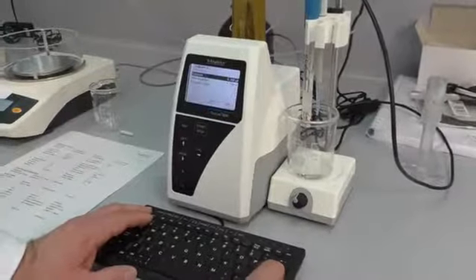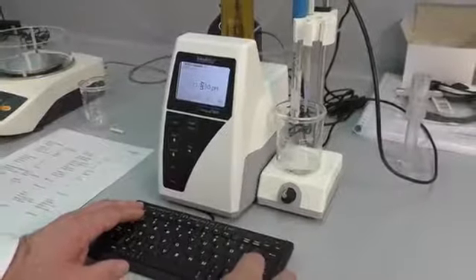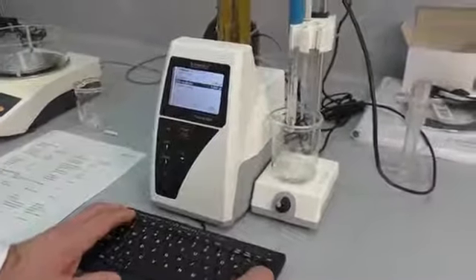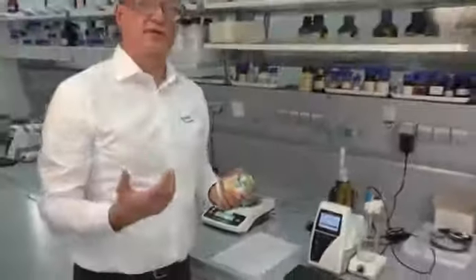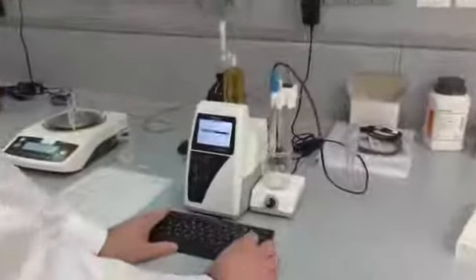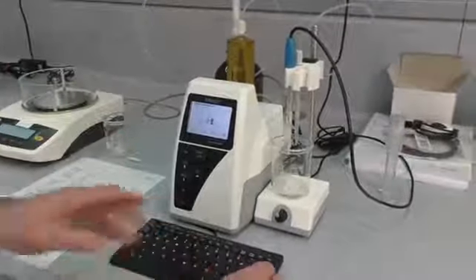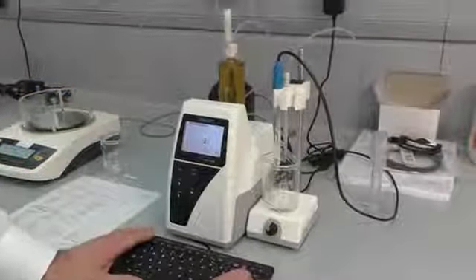It's the same, sorry, but the delta endpoint 1.2 is a little bit too small. We will change it to 1.8. Because the sample is a solid sample and has to be mixed for a while, we can enter the mixing time into the sample preparation, and we will use 60 seconds, but we can also use 120 seconds, 180 seconds and more.